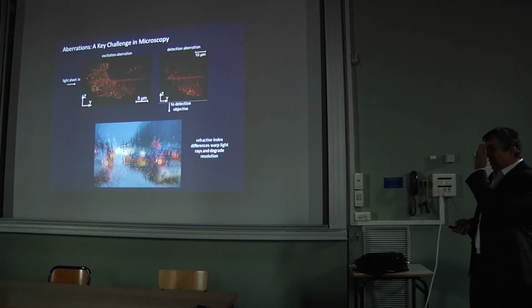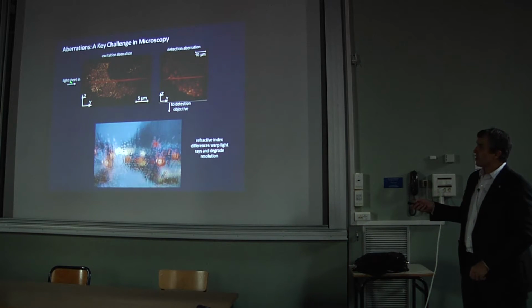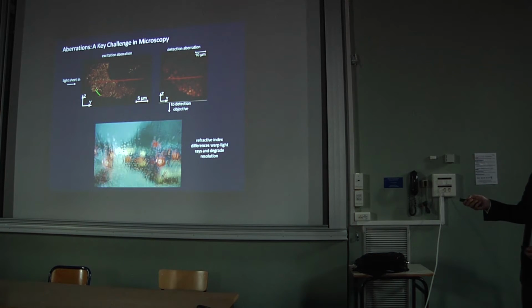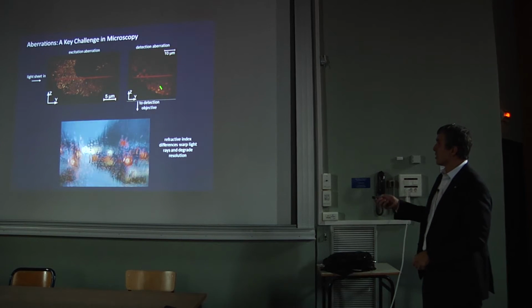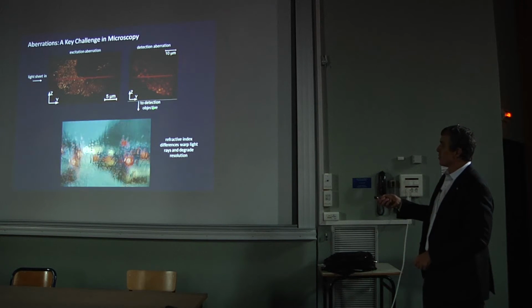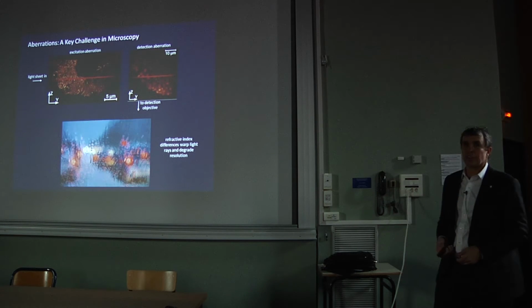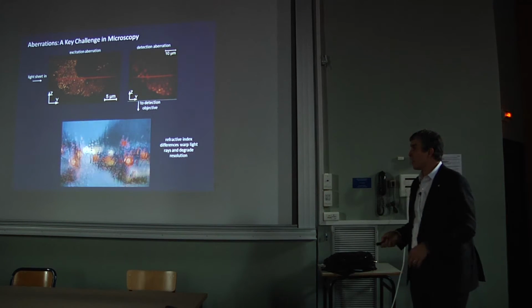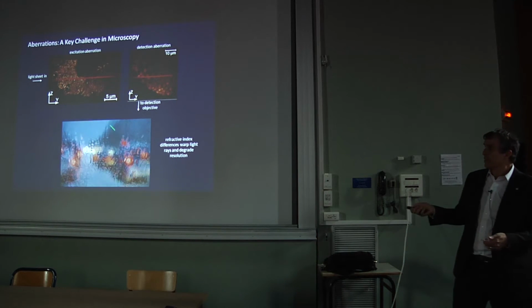The challenge with doing that is that if we're going to use, for example, the lattice light sheet, as the light sheet goes in, the refractive inhomogeneities of the sample scramble the light. So initially you have good resolution, good signal, but then it gets worse and worse as you go in. The same phenomenon happens on detection: the light from these nuclei that are closest to the objective doesn't get scrambled, but the ones that are deeper down, because their light rays have to go through the specimen, get scrambled, and then you have low signal and low resolution. So it's exactly the same phenomenon as water on your windshield scrambling the light that comes from the cars in front of you.